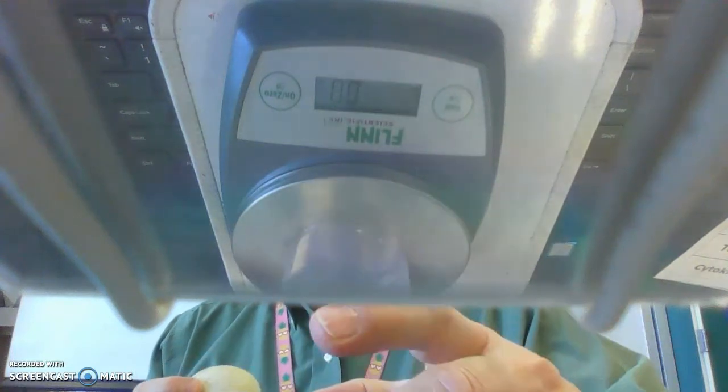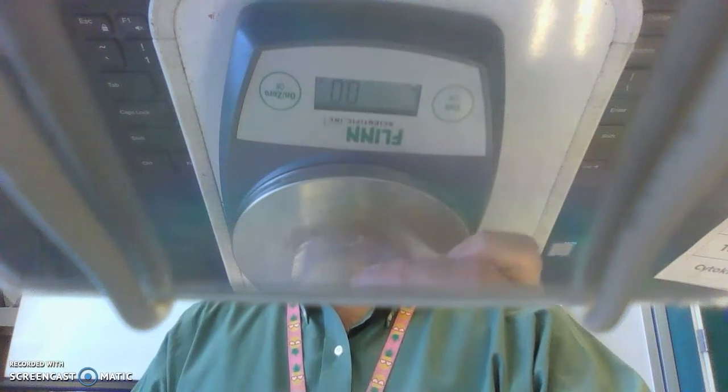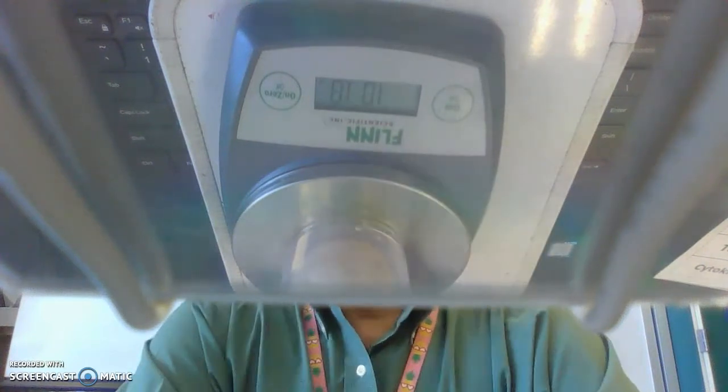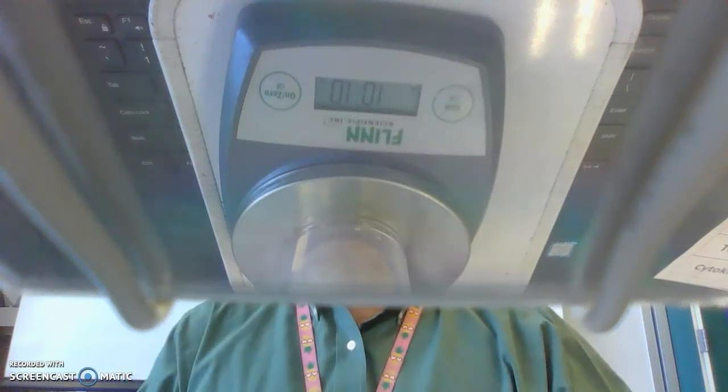So first, the cup has a mass of 8.5 grams. Okay. Then, if I put the egg in the cup, the egg has a mass of 101 grams. That's the initial size of the egg, in terms of its mass. We're going to be measuring the mass of the egg after each of the changes that we propose to it.